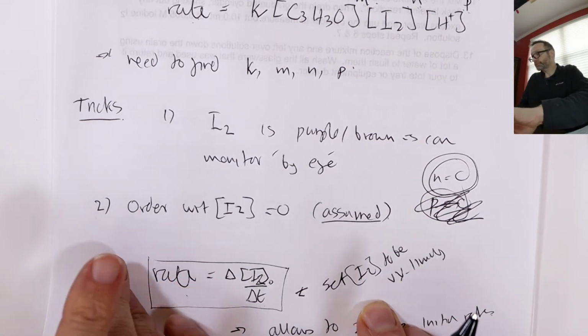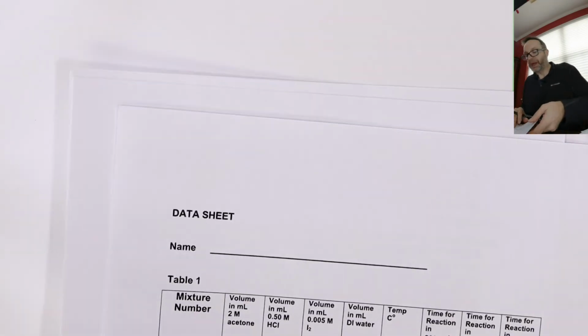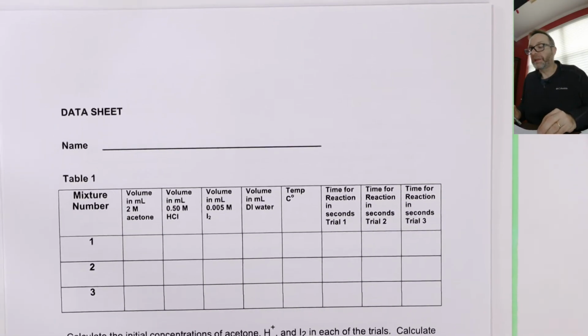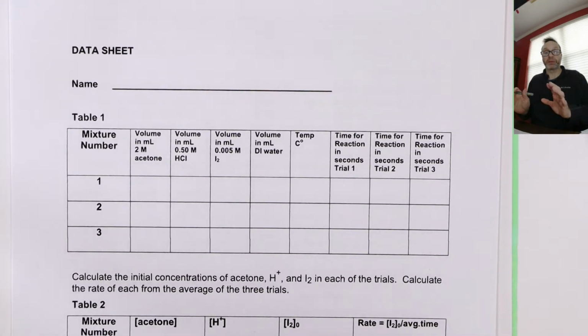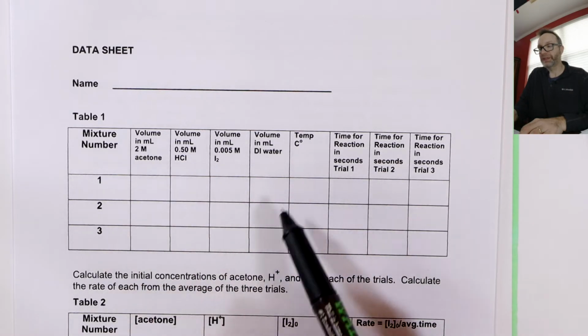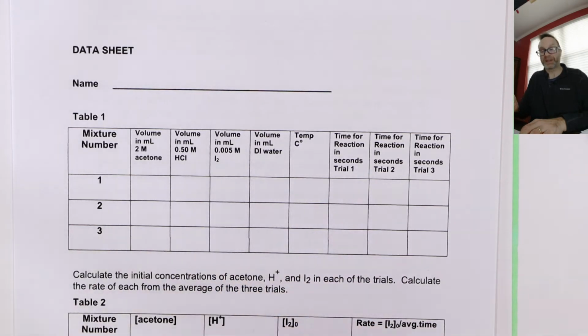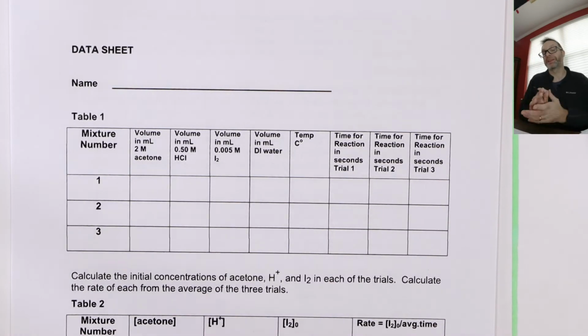Okay, now, when we actually look in our experiment, remember the clever trick we used where we have a baseline, where we have the concentrations of things at a lower level, then we double one of them, double the other one, and then compare to the baseline and do that kind of dividing math. You're going to have to look at that dividing math. I'm not going to go through that because it's nicely explained in the packet. But I will show you where we set those numbers up, so when you divide them, you get the 2 factor. Okay, all right.